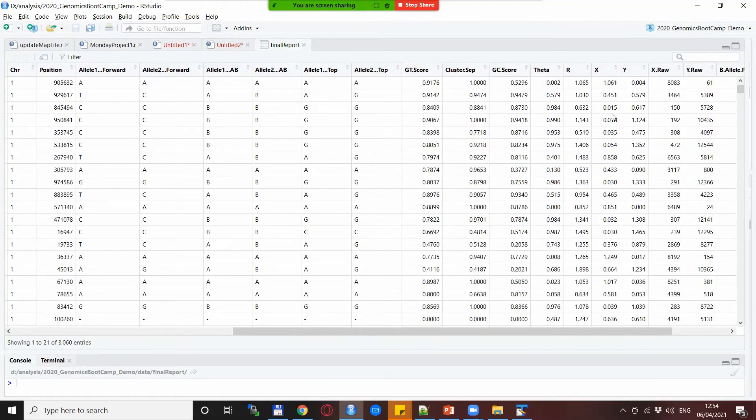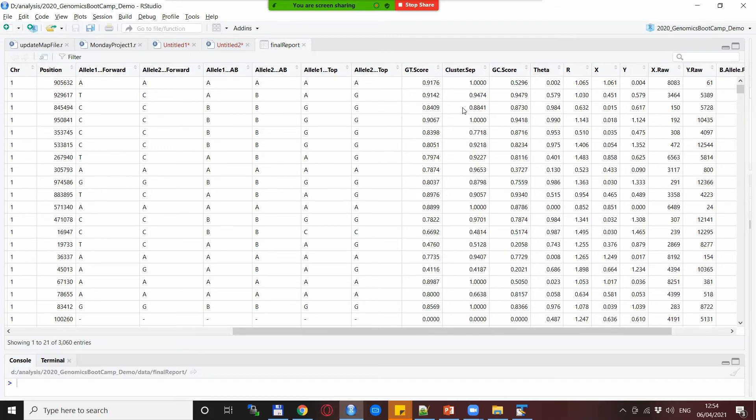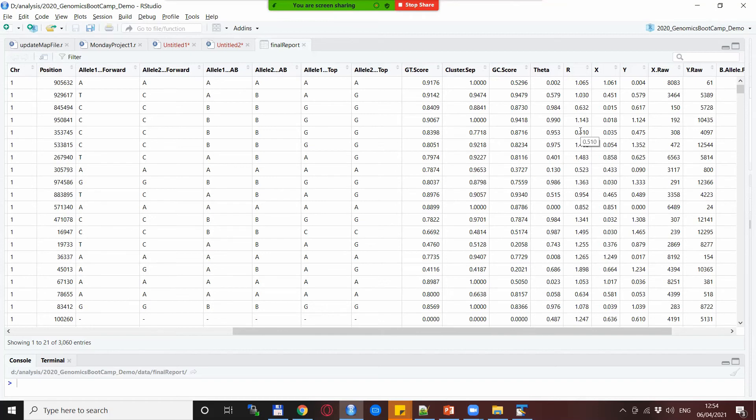Also here are some other metrics for example the cluster sep, the cluster separation, is also something similar to the GT score I believe.